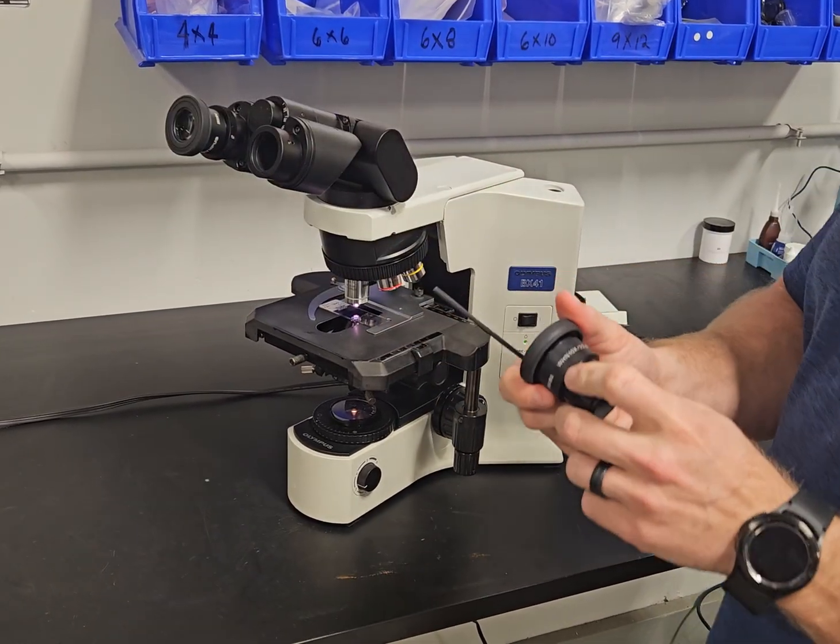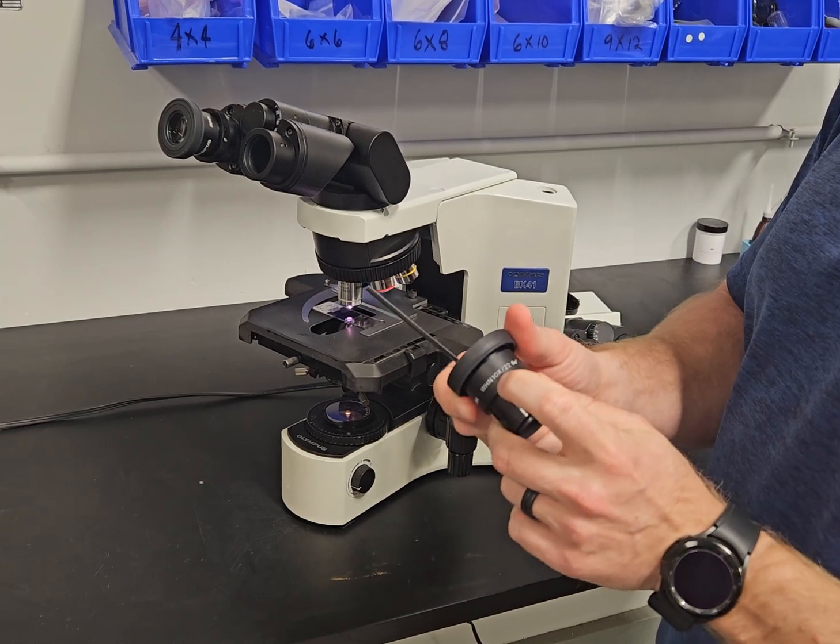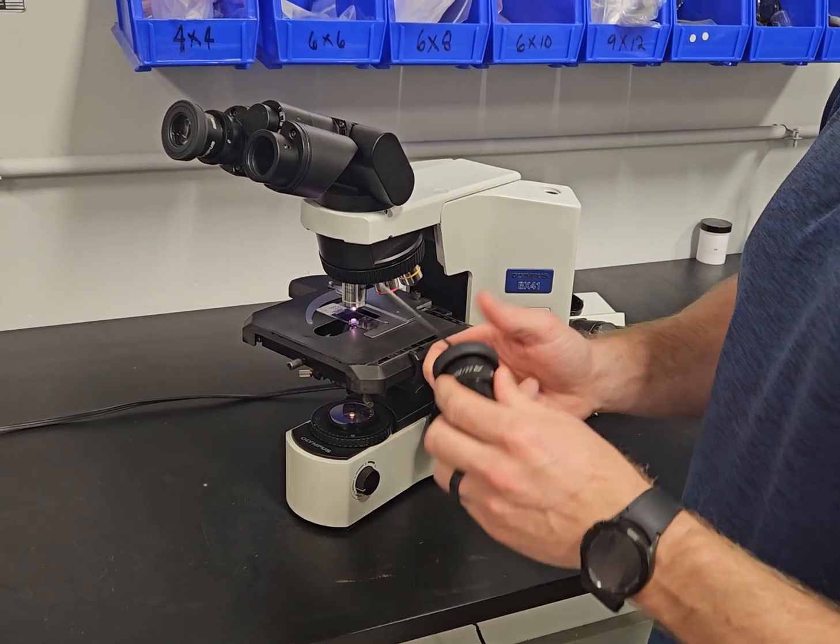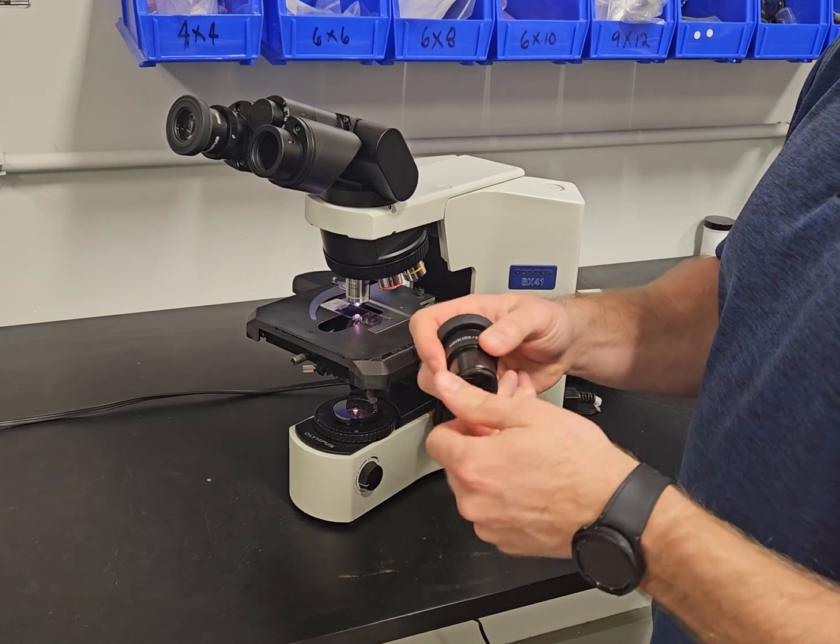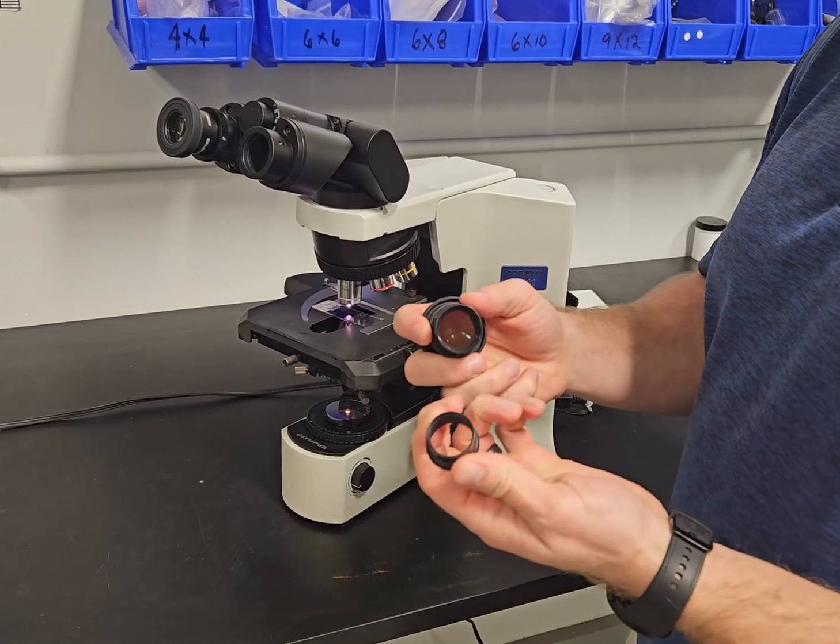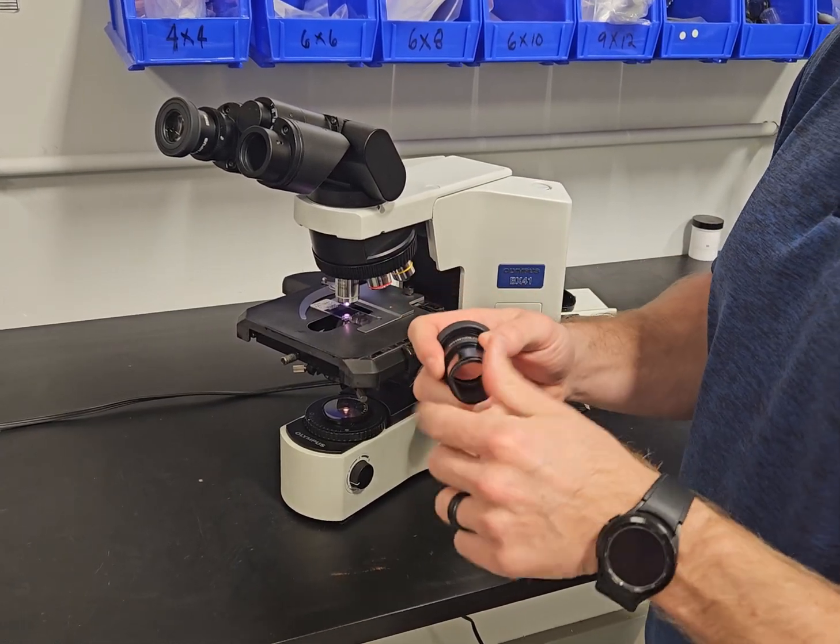It has WHN 10x by 22 millimeter field of view eyepieces. This eyepiece right here, if you're a pathologist and you want to measure, you can add a reticle to it. It has the reticle shelf in there.